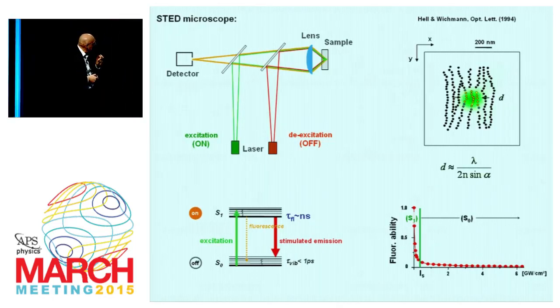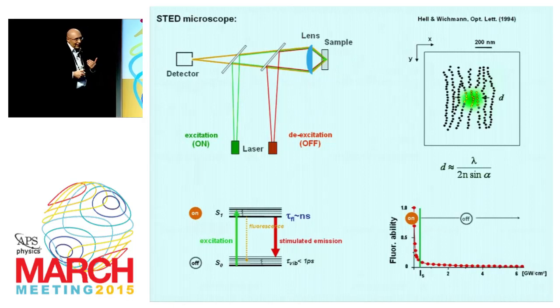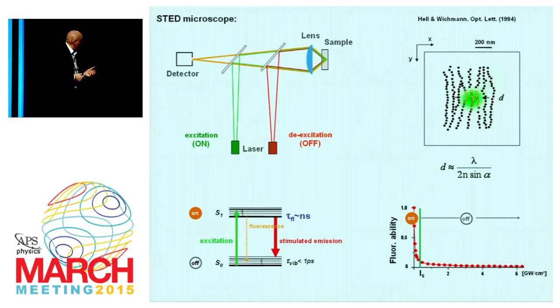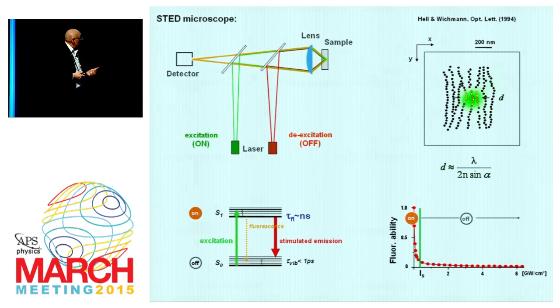Because as soon as it gets up, it has a quick vibrational decay, it instantly is pushed down. Here it quickly relaxes, and you're not Rabi-cycling it all the time. It quickly relaxes to the ground state, and so you basically disallow the molecule to occupy the excited state. You can turn it off. No matter how many green photons you put on the molecule, the presence of the red-shifted beam turns the molecules off. And now, you see what we want to do. We don't want to turn off all molecules. It wouldn't make sense.